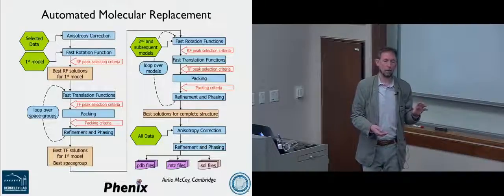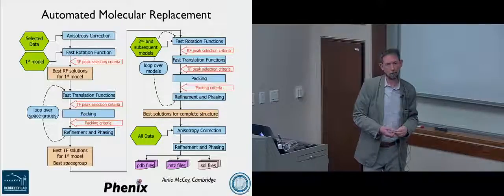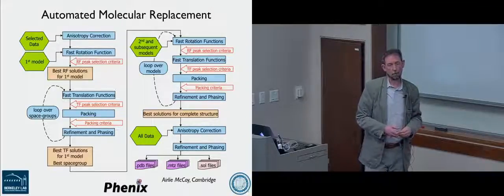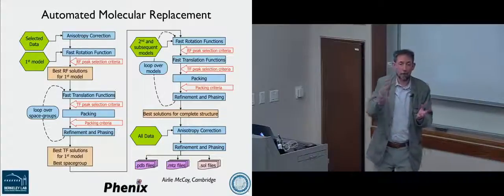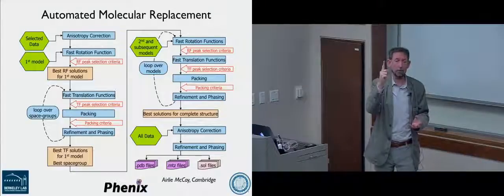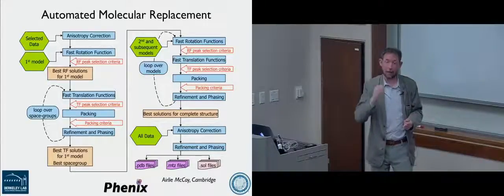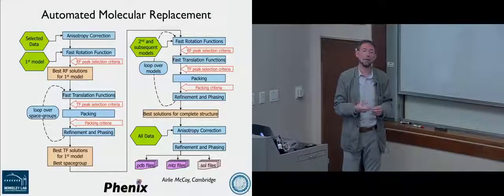Okay, so that would have been greater if you have many solutions, right? But if you have only one solution, you have no choice. But it's a search problem, though. We have to search over many possible orientations. We're trying to find that one orientation where it looks good. So you use the scoring function for that. For that, yes, exactly. And it is good because it's generally discriminating. Okay. Yeah.